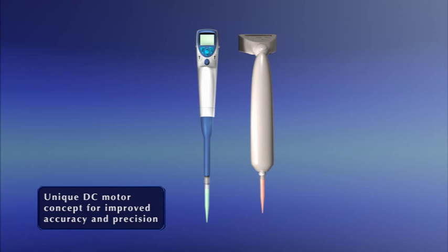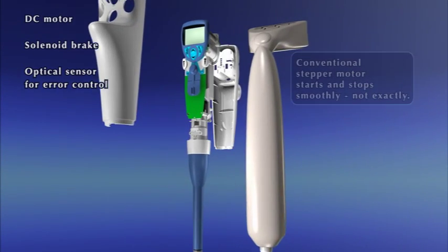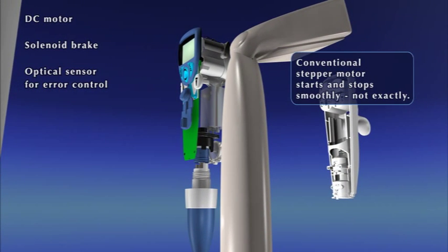E-Line is unbeatable in accuracy and precision thanks to the patented DC motor concept developed by BioHit. The concept includes the DC motor, the solenoid brake, and the optical sensor.